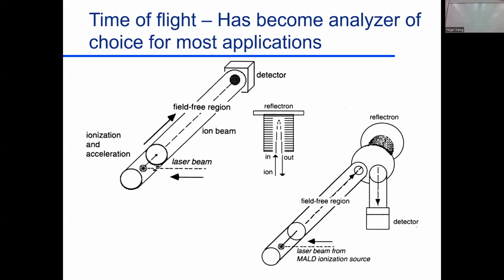So if your energy is always fixed, 1/2 mv², your velocity changes. So your small particles would have a very high velocity. The large particles will have a slower velocity. So this whole mixture of ions gets separated by how fast they move down the tube. Small ions go quickly, then the next, bigger and bigger and bigger. And so this is really, really neat as a technique goes.